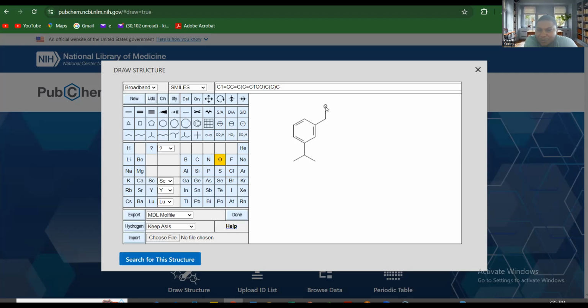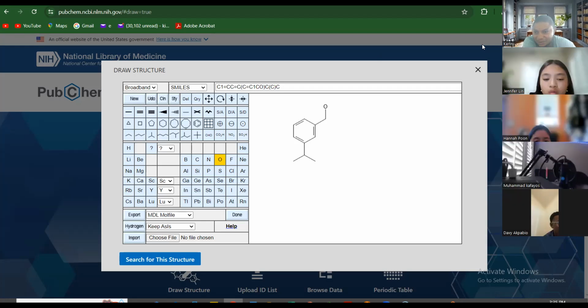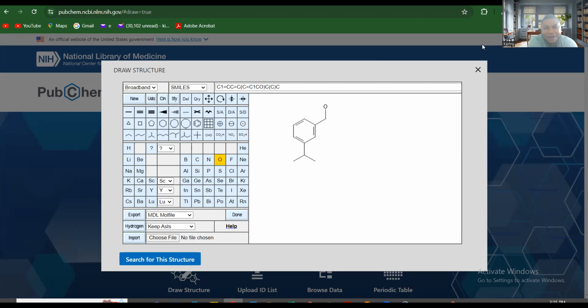Were you able to open PubChem on your laptop? Oh, great. I think David got that. I want to believe every other person also got that. So I have to make my video screenshot so that I can see. So this is our own designed drug. That's great. So let's save this now.